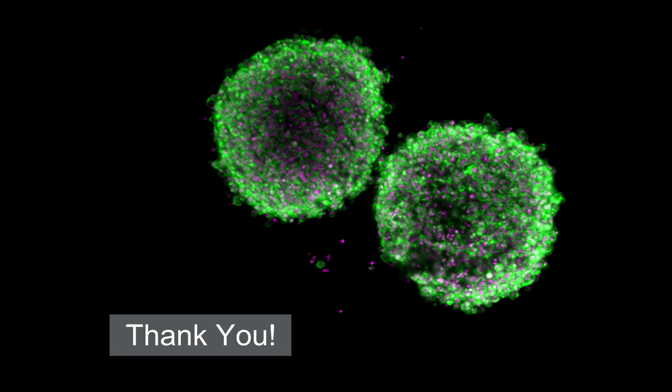Thanks, Christy. That's a great question. Imaging these thick structures, we do have to worry about photobleaching of our fluorophores and also the toxicity induced in our cells by exposure to excess light. For photobleaching, we can use confocal imaging and limit our detection to a single plane of light. We can also use the mounting media that I showed, specifically ProLong Glass, that will preserve our fixed samples and prevent photobleaching or destruction of fluorophores in those models.